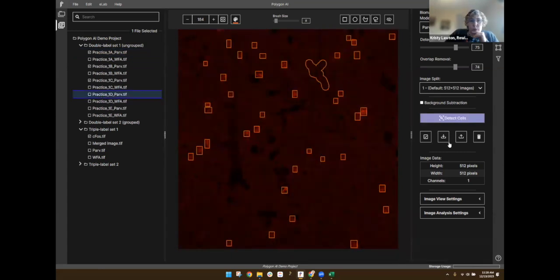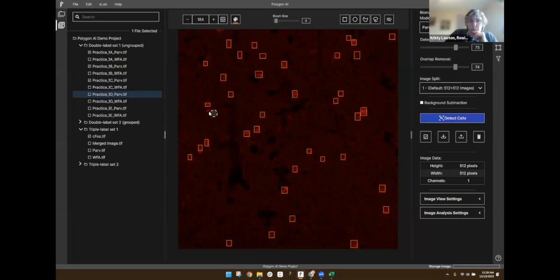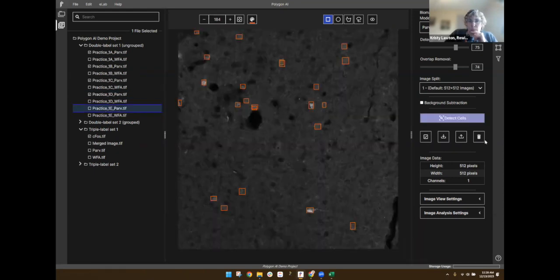Do this on a few more here. Fix that one again. And that again. I don't like those results as much. There we go.